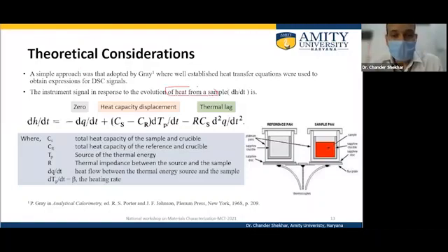Now let us look at the theoretical considerations as far as the evolution of heat from the sample goes. There is a simple approach given by Gray way back in 1968. He gave a very simple transfer equation which gives the general formula for the DSC signal.